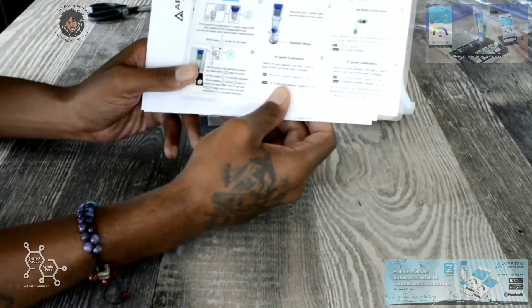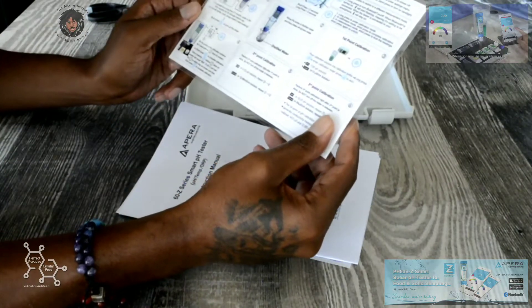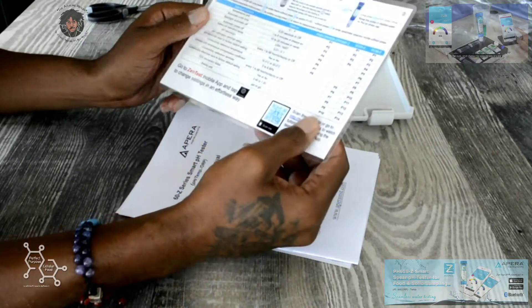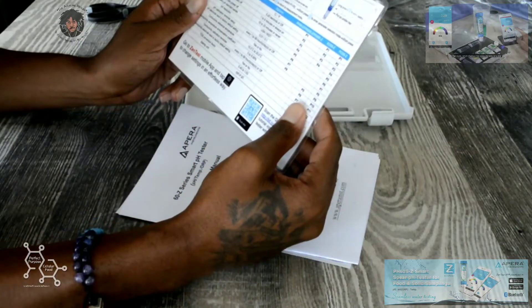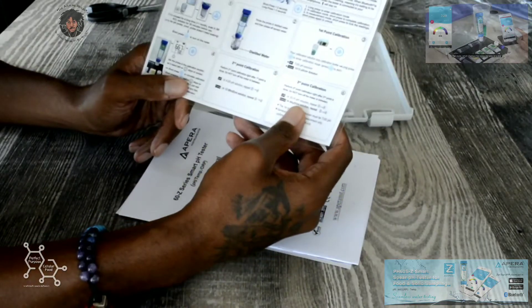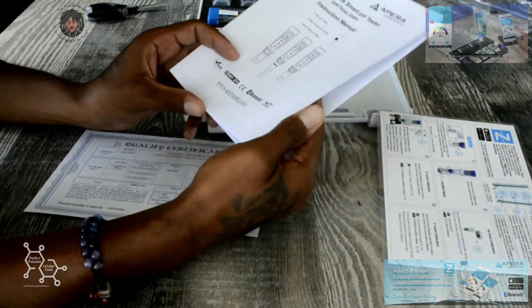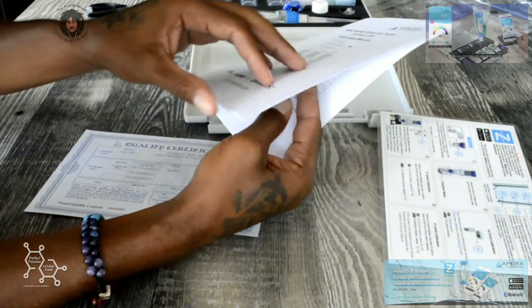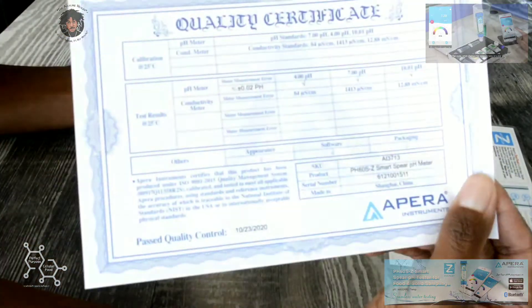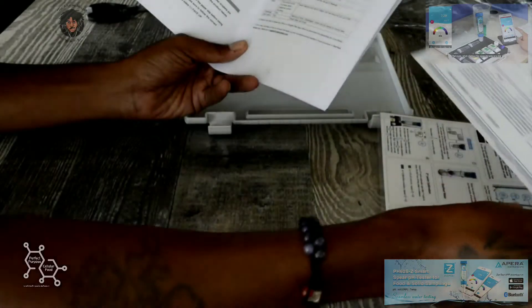Off the rip, I'm really liking their presentation. You got the laminated sheet here, which seems to be some sort of instructional guide. The laminate is really dope and sturdy, so it'll basically last — it won't be a flimsy piece of paper that can get wet or torn. So it's built to last. Then you have your instructional manual and a quality certificate right here. It's a really nice presentation.